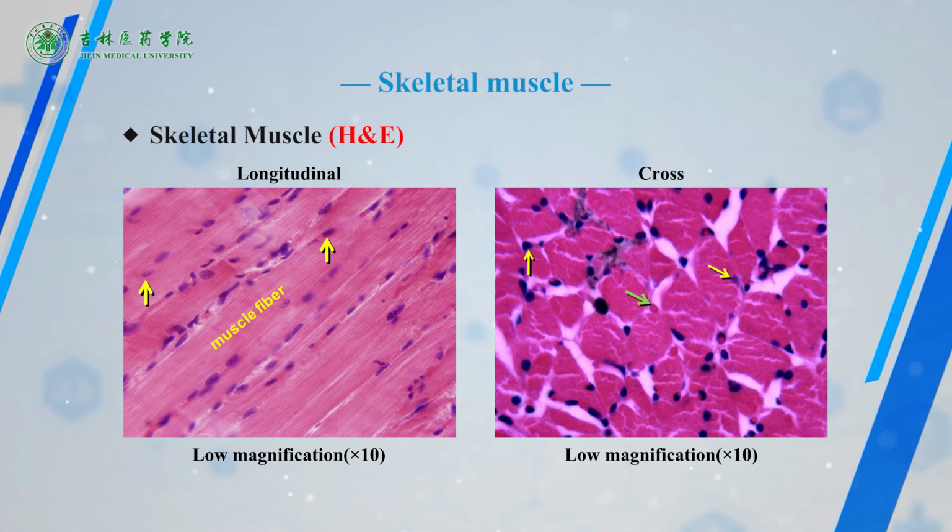In the cross-section of skeletal muscle, part of several muscle fibers are rounded to polygonal cells with peripherally located nuclei. Yellow arrows indicate. Eosinophilic staining characteristics and punctate appearance are due to the contractile proteins. The surrounding endomysium contains capillaries or small blood vessels.